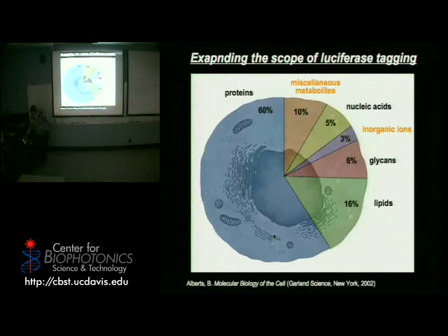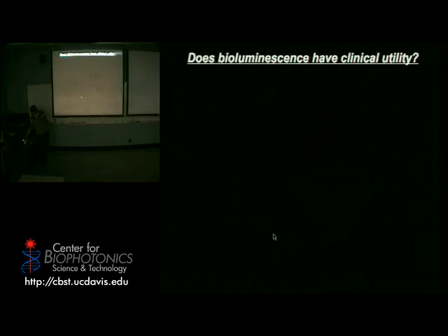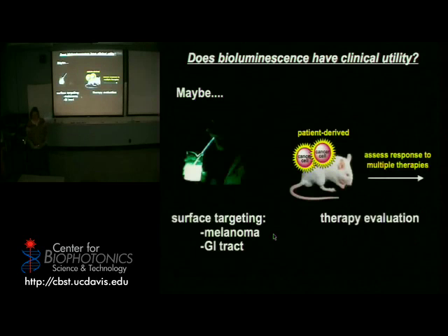I'm going to skip over a couple of these to a main question I think that always comes up: does bioluminescence have human clinical utility? Because all the data I've shown you, all the pictures I've shown you, have always been from the mouse. And I think the answer is maybe, because we're always limited by depth, right? And how hard it is to get light out of things that are thick.